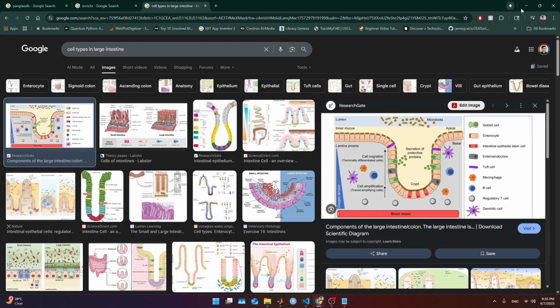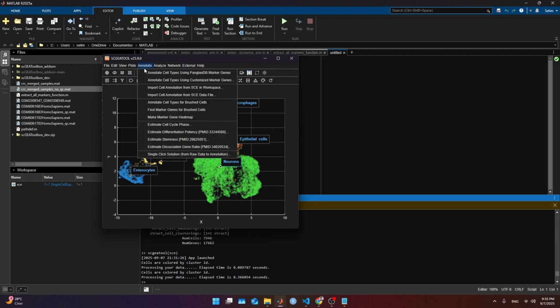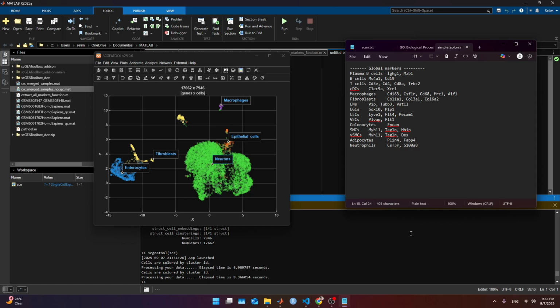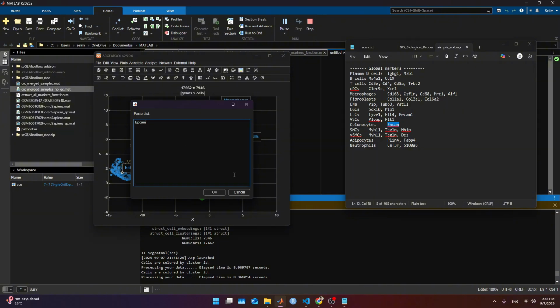The first thing we can do is go back here and start looking for some marker genes that should pop up. I have some mouse markers that we can explore. Those might not translate precisely, but we can explore them. So if we look at the first, let's say EpCAM, it's a very important marker in intestinal samples.